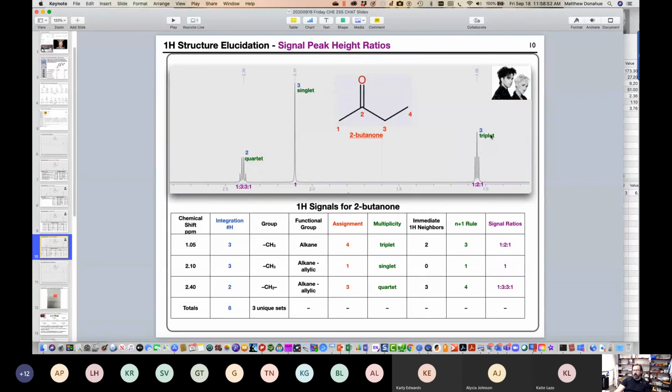So if you look at, let's start to the right here for the triplet. Look at the ratio of these sort of peaks in the triplet. If you were to measure this, and you can kind of do that according to these rectangles. So say this is maybe 1, 2.5. So I'm counting these like rectangles here, right? 1, 2, 2.5.